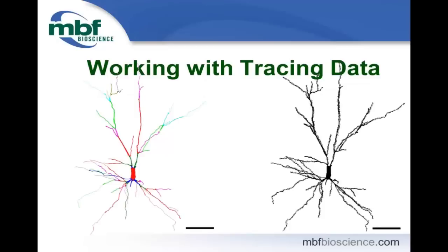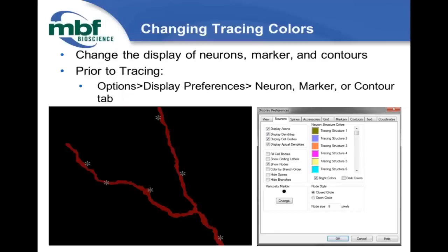Now that we've wrapped up working with images and image stacks in Stereo Investigator and Neurolucida, we're going to talk about working with tracing data — neurons that you reconstructed, so dendrites and axons; contours that delineate regions of interest; and markers you place to mark particles, cells, or varicosities. We'll start by changing tracing colors.